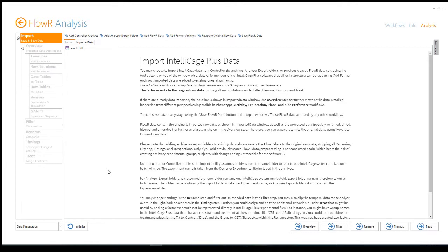You can load those R data and then analyze them. In case you have only those data and you want to get back to the raw data, the original archives you put in are always stored with these data, so you can revert to them.